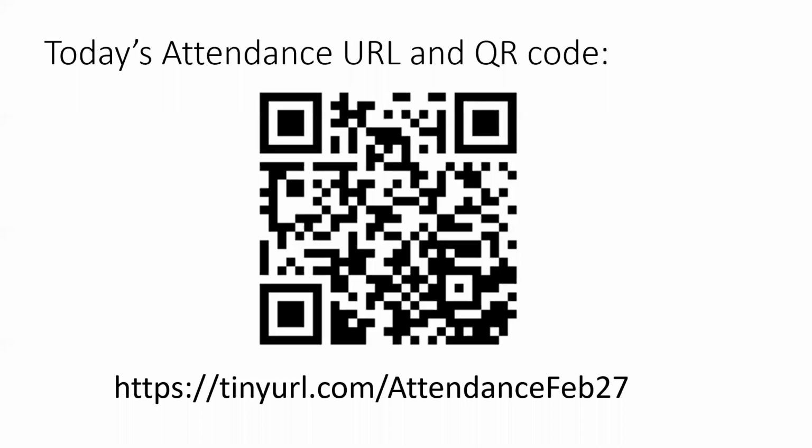Okay. Now the next two questions are coming from Gabe. And Gabe, if I am not understanding your question correctly, please feel free to type in more, either in the chat or the Q&A. So the first one: is it better to use the inner or outer coordinates in DGV Gold when following the CNV guidelines for a CNV being common? So I guess the question is really, if you're trying to decide how well a DGV Gold Standard entry overlaps the CNV that you are evaluating, is it better to use the inner or outer coordinates? If that makes sense, Jeff, if you have any comments on that.